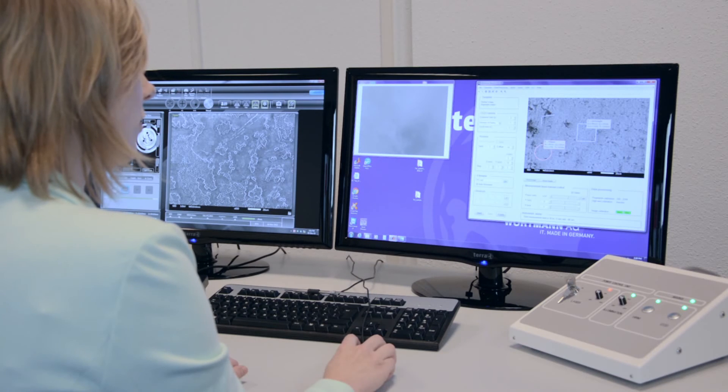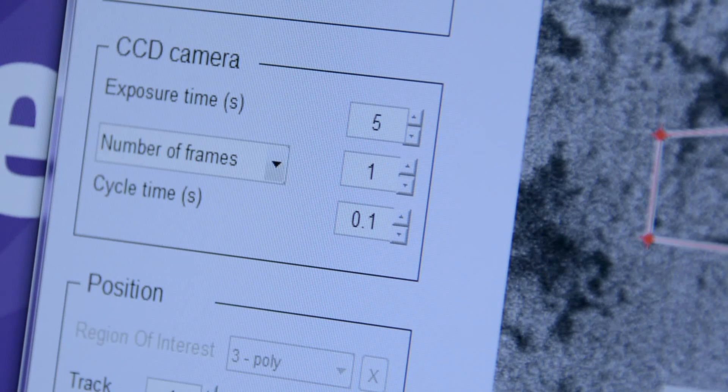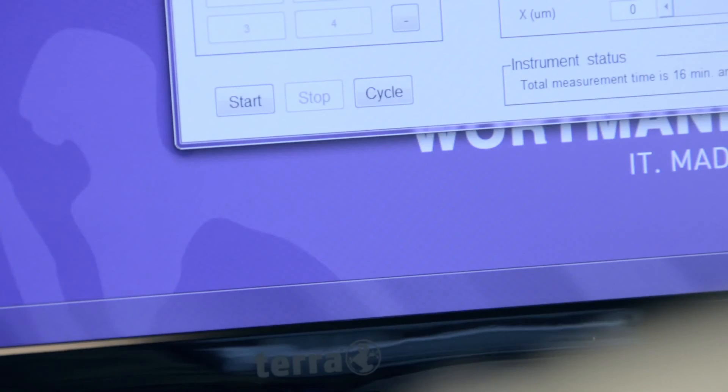For each region of interest, different measurement settings can be selected. The measurement can be started with a simple press on the start button in the software. The measurement is automatically performed without further user activity.